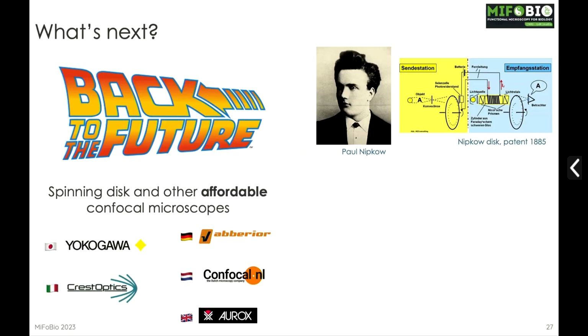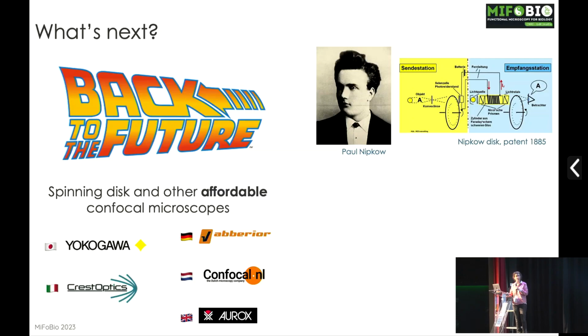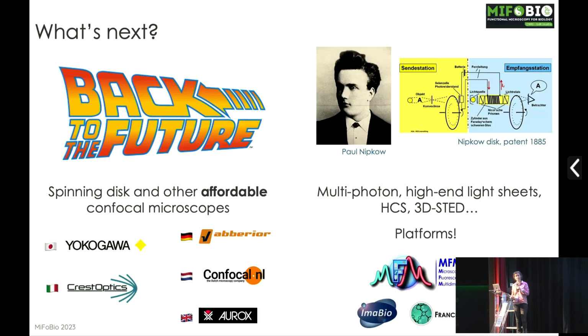Of course, not only spinning disk actually, but all sorts of confocal microscopy are now available from different companies, and they are cheaper than all the previous techniques that I've shown. So this is actually affordable within the lab. So you don't have to have a true ERC to have a decent equipment. But then when your question requires those fancy techniques, you are happy to benefit from the support from the platforms.